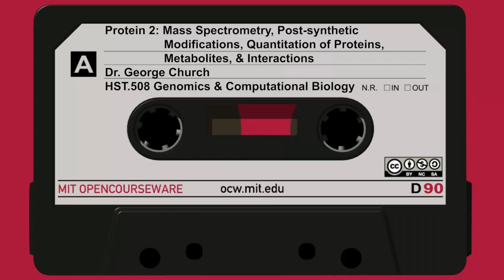And the outliers initially were such things as frame shifts in the DNA sequence, producing a wrong calculated protein. Once those were corrected, then there were observed proteolytic cleavages, which could be mapped down to the exact amino acid. And then those corrected a few more onto the line, and the remainders were other post-synthetic modifications, such as phosphorylation. So here's a reason to embrace your outliers. Each one of these things is an exciting story where you either have a correction to a previous data type or a new discovery of a post-synthetic modification.